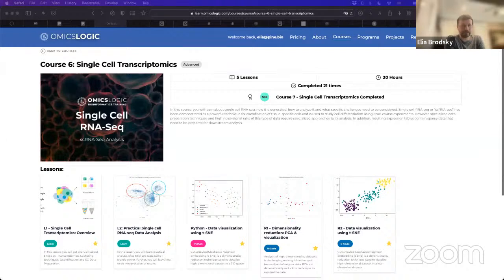I'll introduce some data sets. I'll talk in detail about some conceptual things that you have to know when you're trying to analyze data. And I'll introduce you to the resources that you can benefit from, just trying to understand how methods of analysis fit into the full overview of how this data should be analyzed and what the challenges associated with that are.